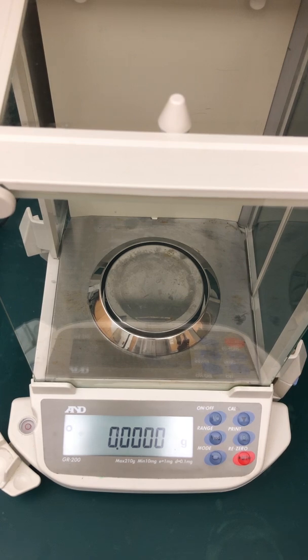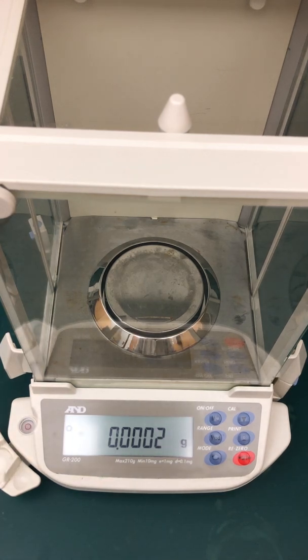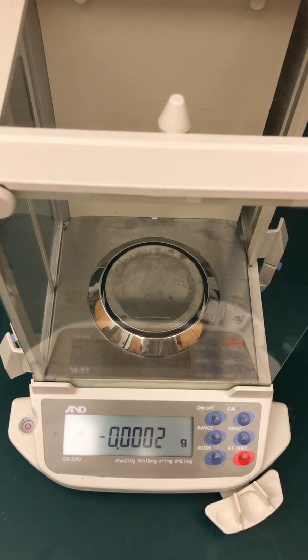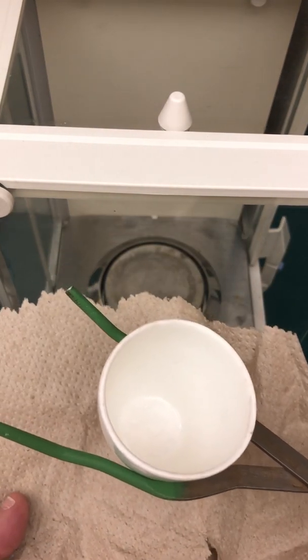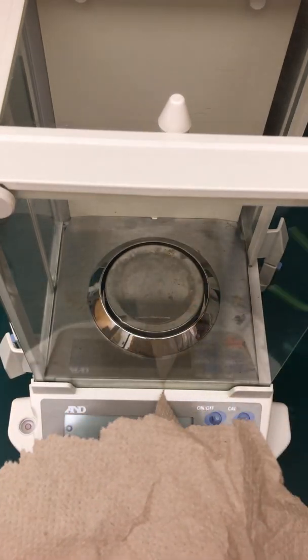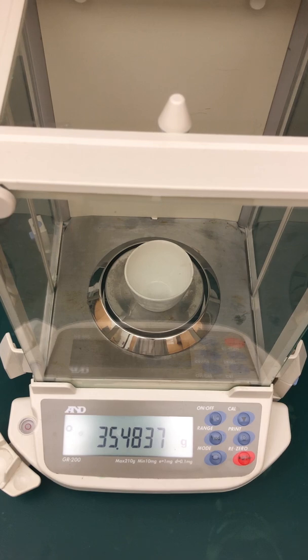Here at the analytical balance, we're about to weigh our starting materials. First, make sure the balance reads zero and the windows are closed for accuracy. Remember that any vibrations or leaning on the bench will affect this very sensitive instrument. I'll open the window and bring in the crucible with crucible tongs and paper towel underneath — place it in there very carefully without touching it with your hands. The mass of the crucible reads 35.4837 grams — write that down.